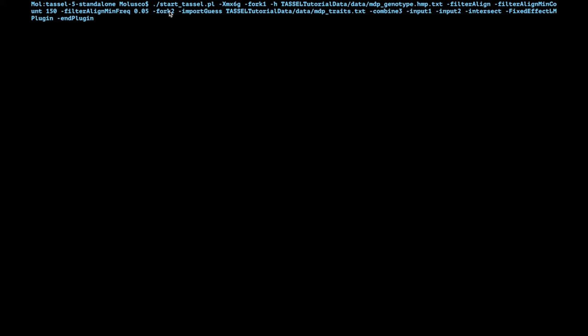Then we'll start a second fork, fork two. That means that we're starting a new thread in memory so that we can do something else in addition to the reading of the genotypes. In this case instead of the dash h we're going to use importGuess. That means that we are going to let TASSEL figure out what we're throwing at it. We can use that in the first fork as well because we're giving a genotype, TASSEL will know that it's a genotype. In this case we're going to give again from the tassel/tutorial_data/data, we're going to give the phenotypes which is mdp_traits.txt.